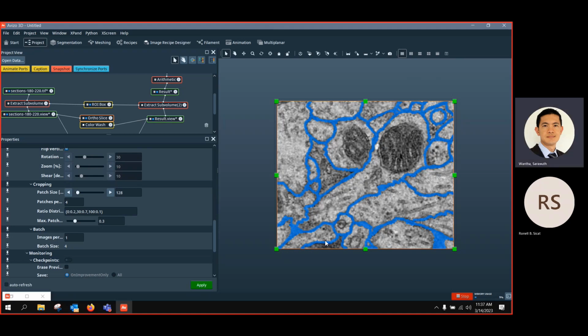Is it advised to augment the data every time you're going to do deep learning training, for example? No, it's not, because like this you see that there are mitochondria everywhere. But you have a really repetitive pattern, because sometimes we have the data.